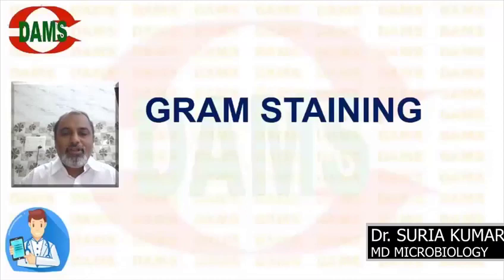Hello, today we are going to discuss gram staining. It's a differential staining first discovered by Hans Christian Gram in 1884. We'll see the procedure.